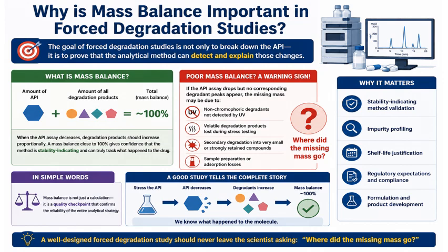Generally 8 to 10% forced degradation is to be done. Different theories and different principles are used by many of the professionals, but generally 8 to 10% degradation may be sufficient to indicate that your method is stability indicating.